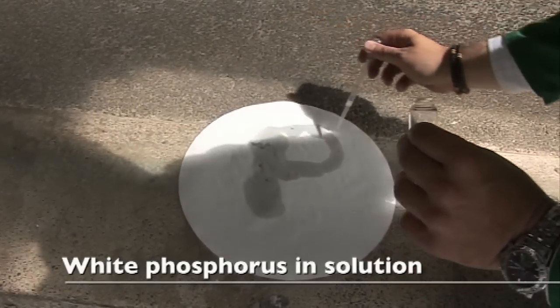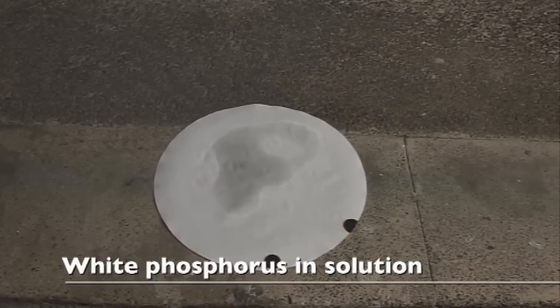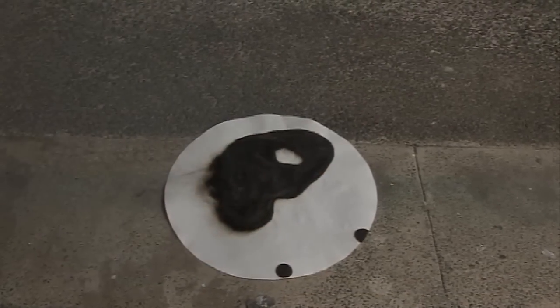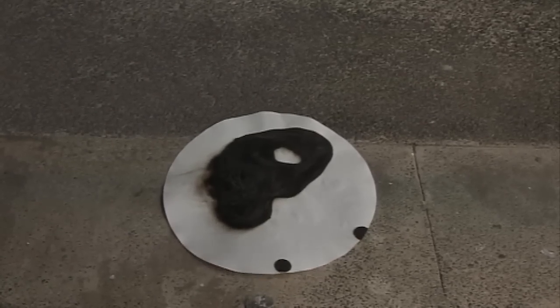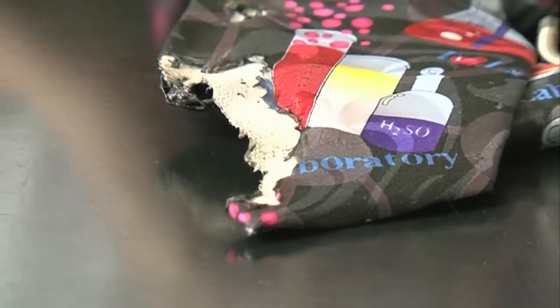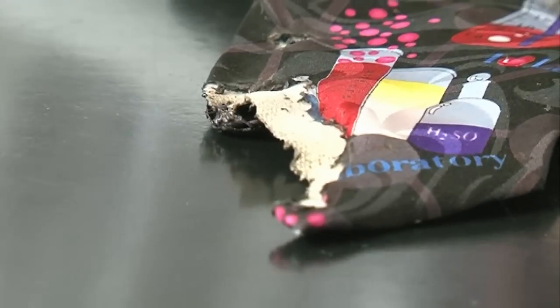As the carbon disulfide evaporates from the paper, you can see that the phosphorus is oxidised in the air and it's taken some of the paper with it to generate a nice P for phosphorus — just a little bit of smoke. I was really excited; I'd never seen a tie that had been burnt with phosphorus before. So he gave it to me provided that I gave him a new tie instead — I've still got to order it.